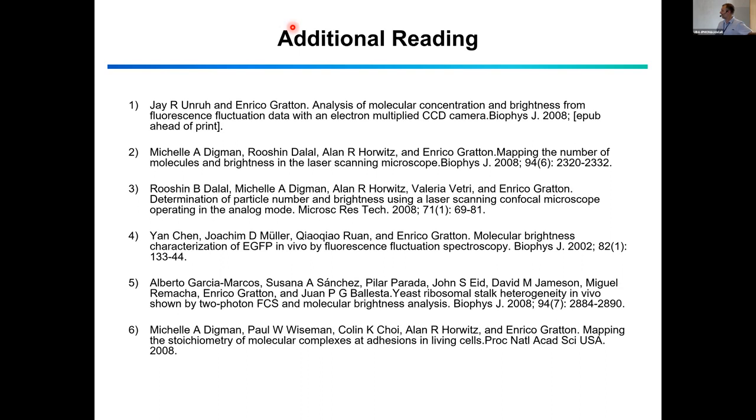So I was thinking, regardless of the number and brightness, you can use larger pixels, but in a larger area, you will have fluctuation for many more molecules, and also you will give the chance to have heterogeneity in the fluctuation.